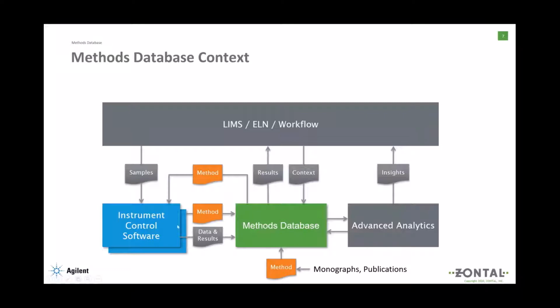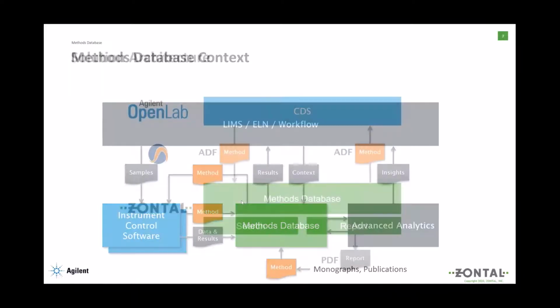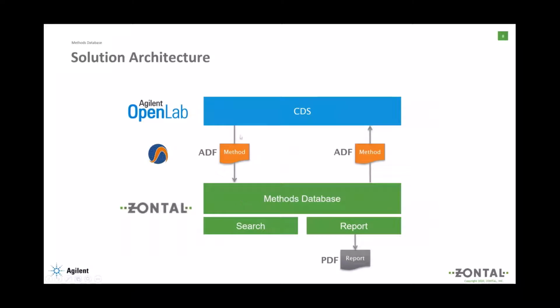So if we zoom into this CDS method database integration, then we can see that we can upload methods to the database, download methods from the database. Then within the database, we can run the queries on those methods and also then generate the human readable report. So in the live demo, we will show OpenLab from Agilent as the CDS system and Zontal as a method database to implement that concept.